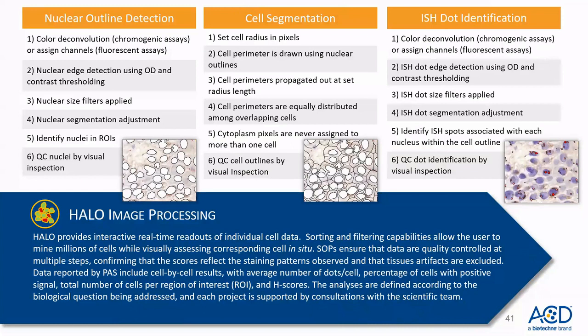Which brings us to the next part of our talk, which is to just let you know that here at ACD, we perform image analysis using the Halo software provided by Indica Labs. The basic principles are the same as what we saw with CellProfiler.